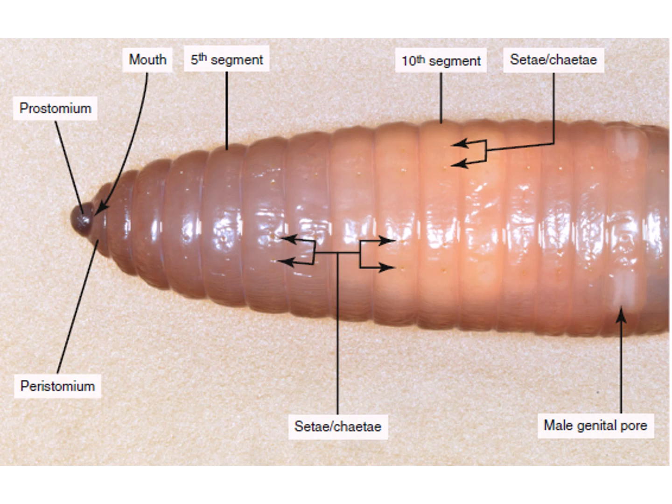We can observe these setae. There would be a pair located on each lateral side of the earthworm. For example, one pair is on the left side and one pair is on the right side. So on each segment there are 4 setae present. These setae would not be present on the peristomium, the first segment, and the last segment, that of the anus. The rest of the segments contain 2 pairs of setae on the lateral sides of the ventral side of the body.